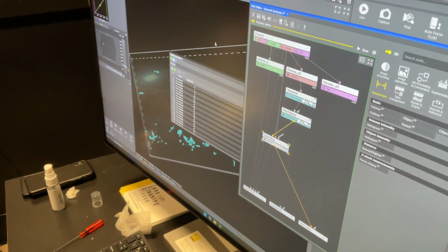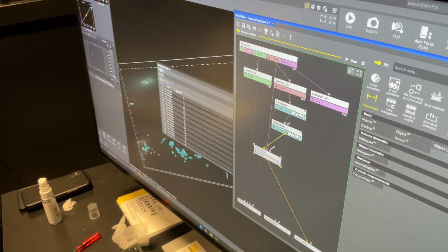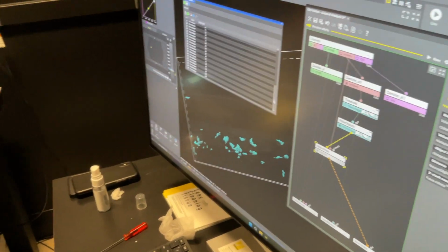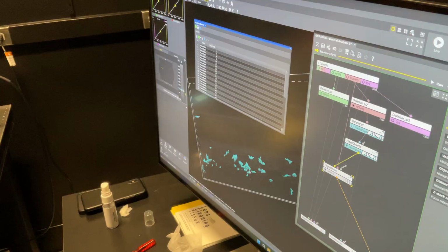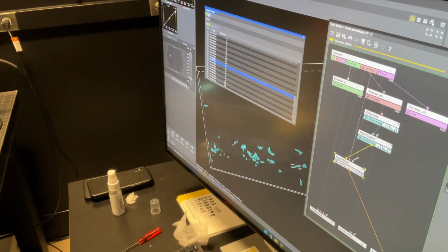Again, we have complete access. I could measure here, I could measure here, doesn't matter. And so this object measurement, it's recording. I guess we'll tell it what. We haven't told it to do anything yet, so for now it's just giving us a rough count, a list as it were, because each of these is its own object that I can interact with, and it's highlighted.